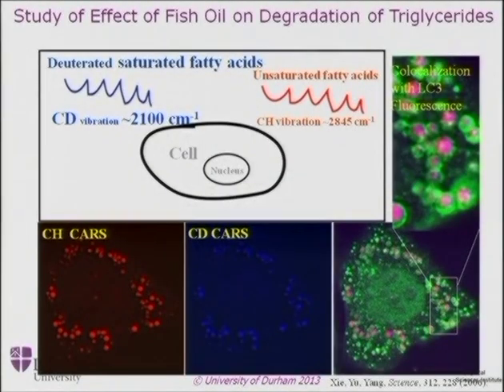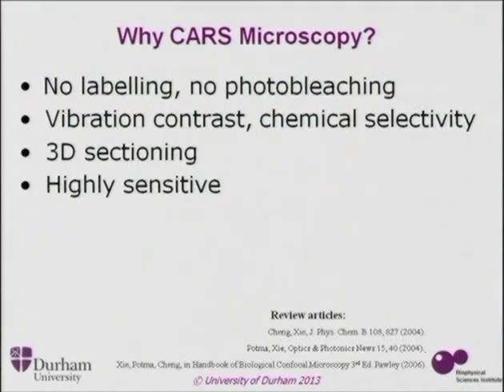And then you would do a standard method of overlaying the various images. In this case, it's been overlaid with some fluorescence as well. But you can look down here to see how things change. So you can slightly label things by using deuterated materials.